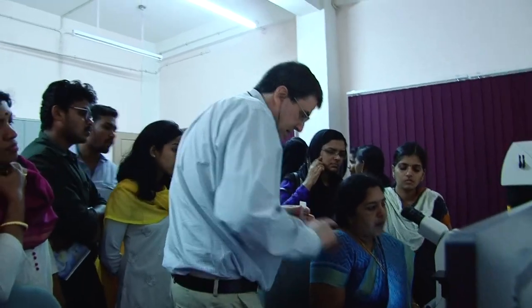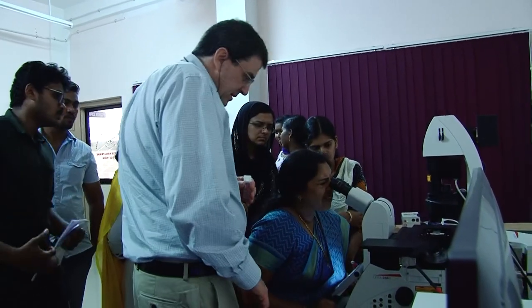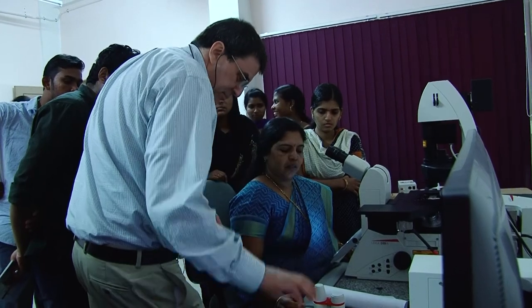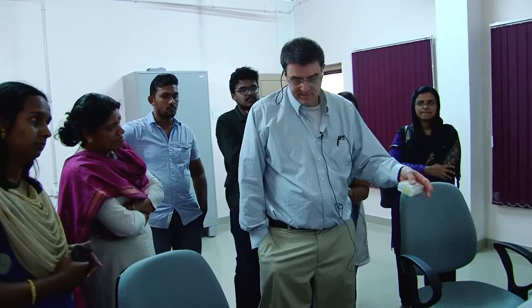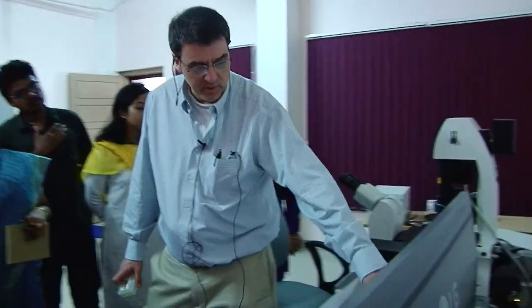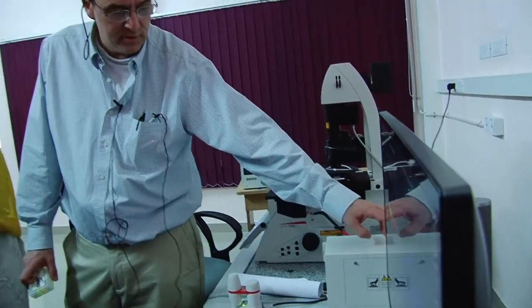Okay, hit this button here, and let me know if you see anything. You see anything? Okay, so here's X and Y, and focus. So find us something pretty and put it in the middle. But does everybody get the idea what this is? So what kind of scope is this? Is this upright or inverted? Inverted, right. And then this does what? No, this isn't your laser source. This is just your fluorescent light. This is your fluorescent light box.